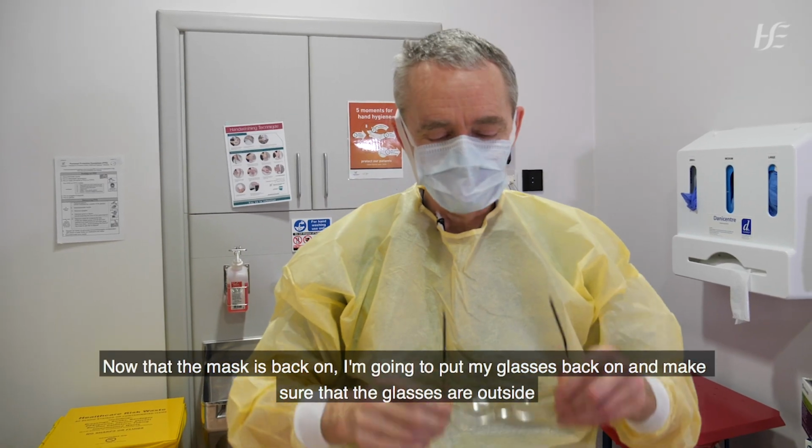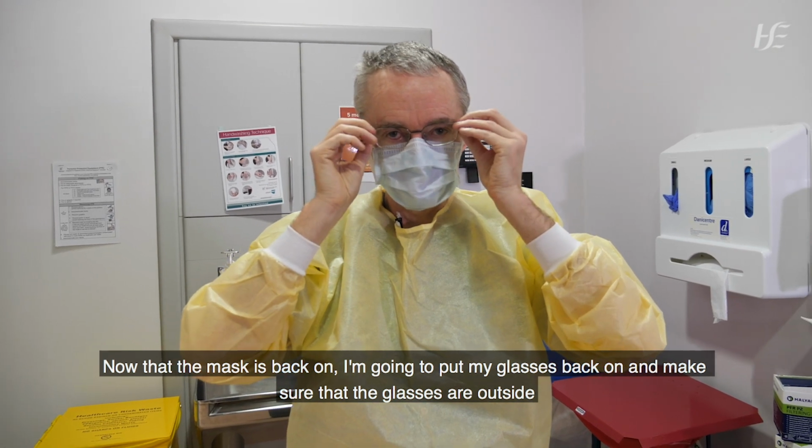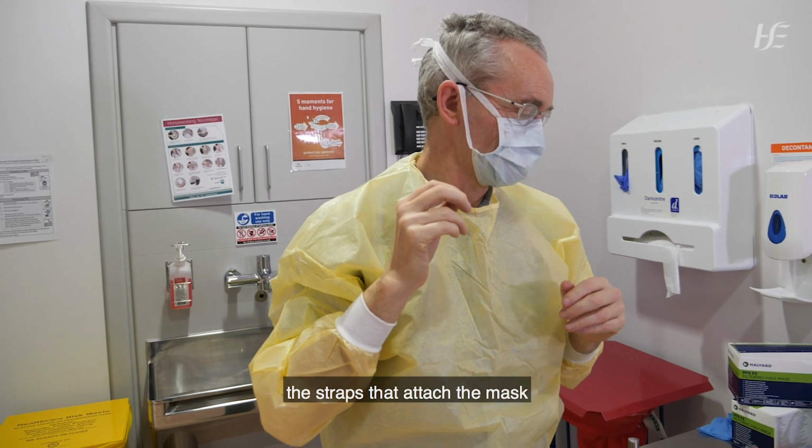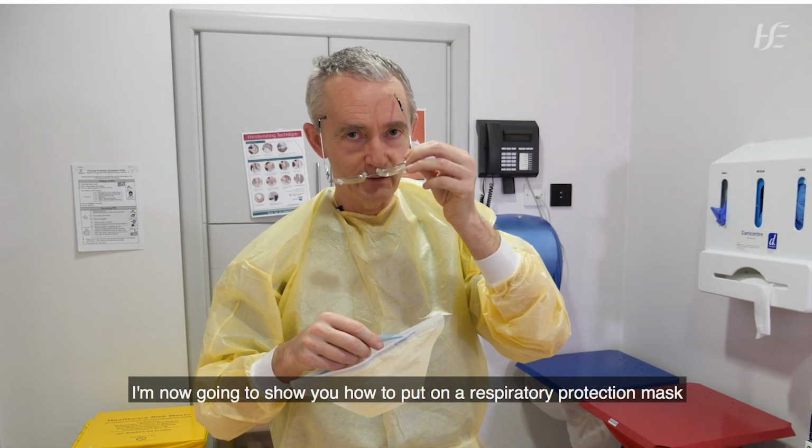So now that the mask is back on, I'm going to put my glasses back on and make sure that the bands of the glasses are outside the straps that attach the mask. I'm now going to show you how to put on a respiratory protection mask.